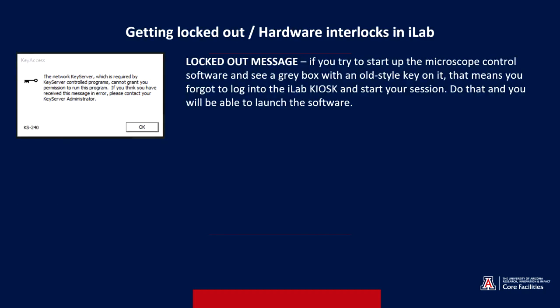If you forget to use the kiosk and try to log in, the software is locked by some other special protective software, and you'll get this dialog box with this old-fashioned looking key. It just means that you haven't logged into the kiosk and started your session. Do that and you should be able to launch the software without any problems.